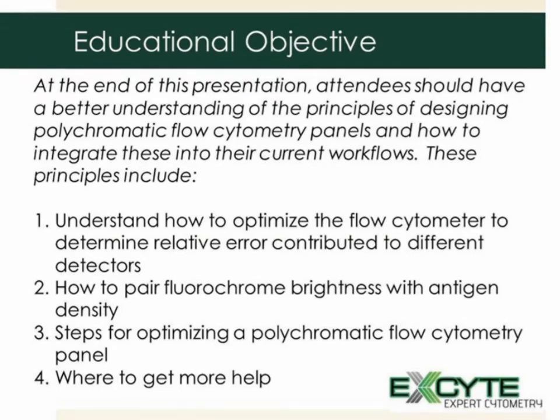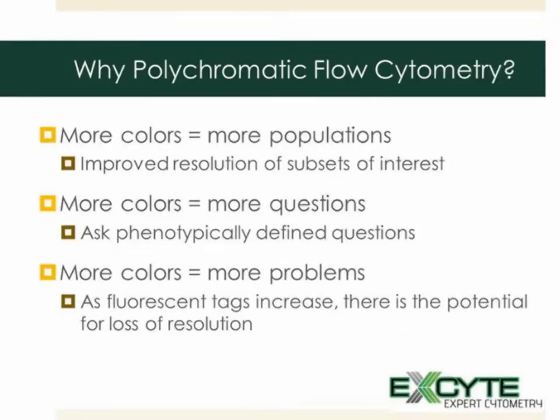The educational objectives I hope to achieve today is that you will understand the principles of designing polychromatic flow panels and how to integrate these into your current workflows. The principles that we will cover today include understanding how to optimize a flow cytometer to determine the relative error contributed by different detectors, how to pair fluorochrome brightness with antigen density, the steps for optimizing a polychromatic flow panel, and last but not least, where to get more help.